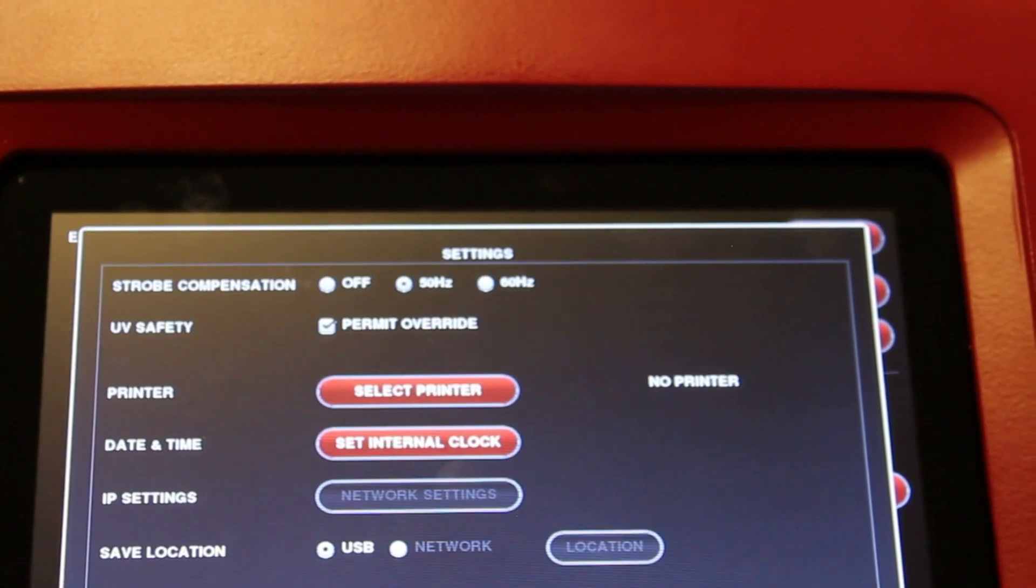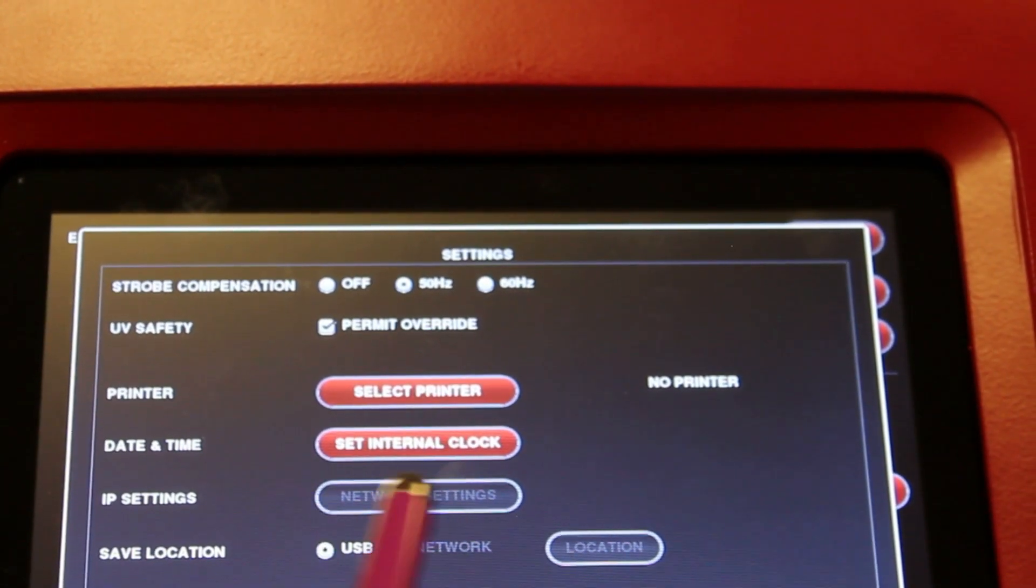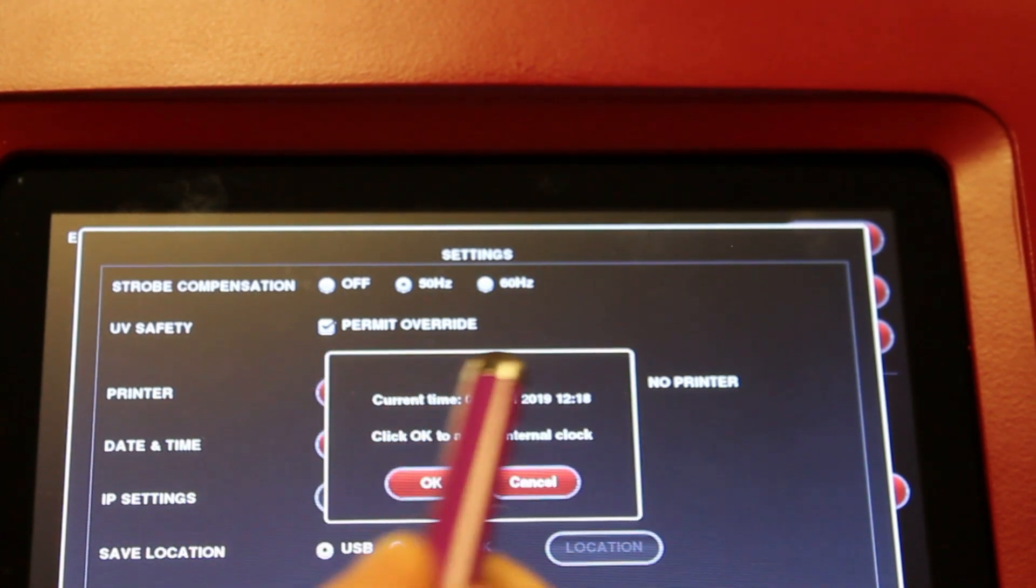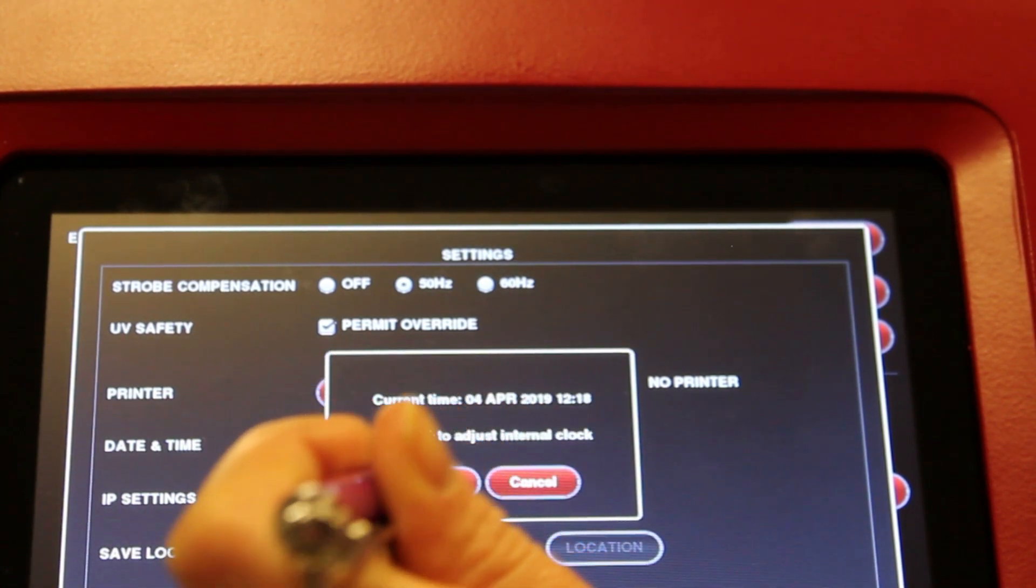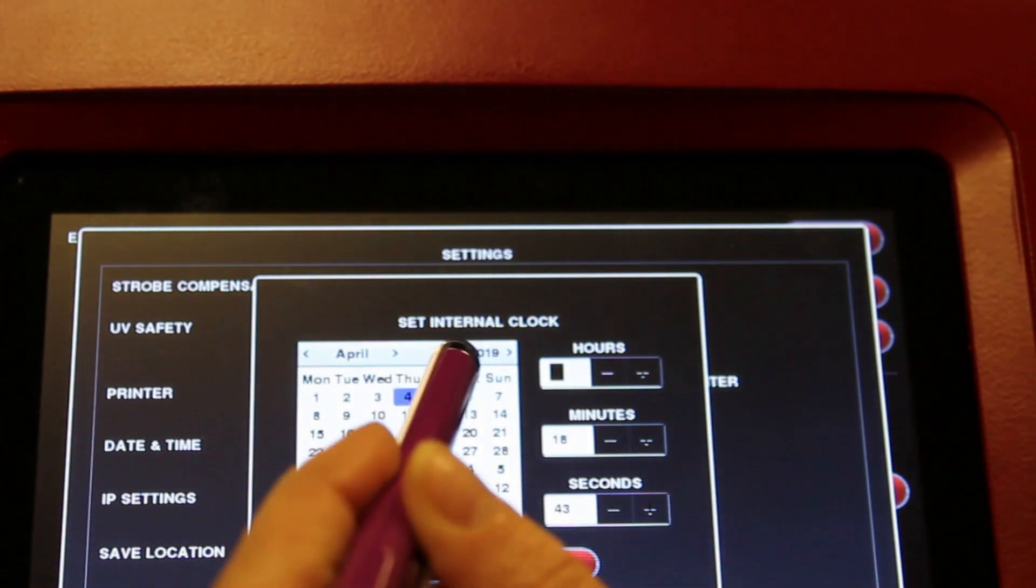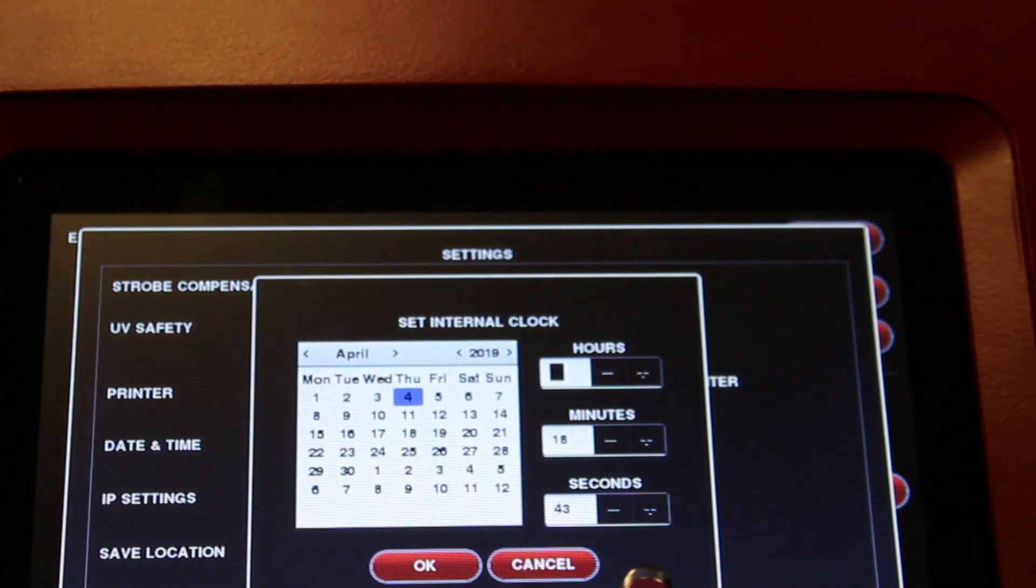You can also change the date and time. You can select the internal clock button here, and then you can select your date and the time.